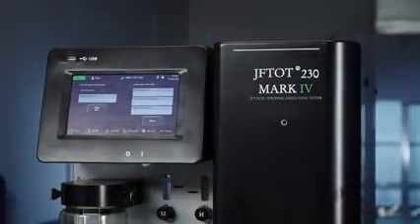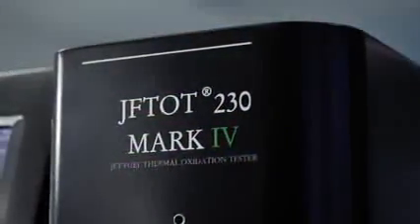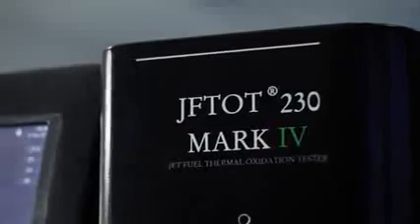You wanted safer, we delivered. You wanted simpler, we delivered. You wanted smaller, we delivered. You wanted the next generation of jet fuel thermal oxidation testing, we delivered.